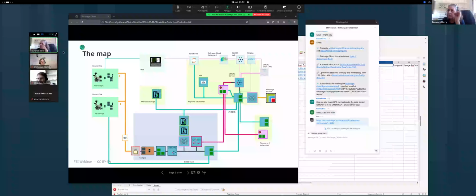In fact, I have two kinds of concerns. The first one is about metadata formatting, because the useful parameters are quite different from light microscopy. So I think we need a template, something like a template to fill in. And my second problem, which is not really personal, but I don't know if it's universal: with the Zeiss electron microscope, the acquisition software is not really belonging to Zeiss. And currently, it's totally impossible to export the metadata regarding the acquisition parameters.